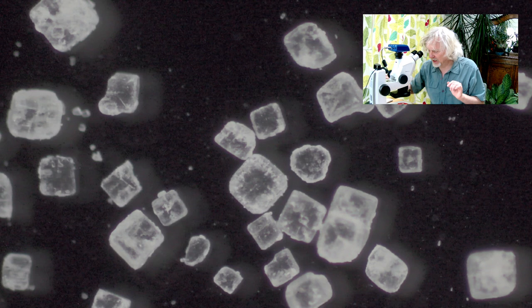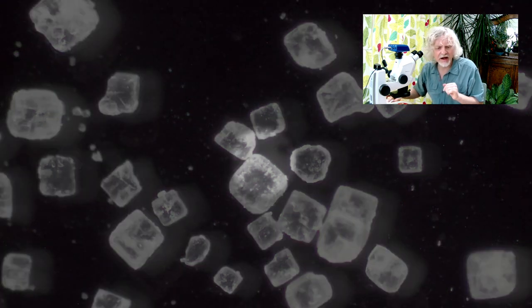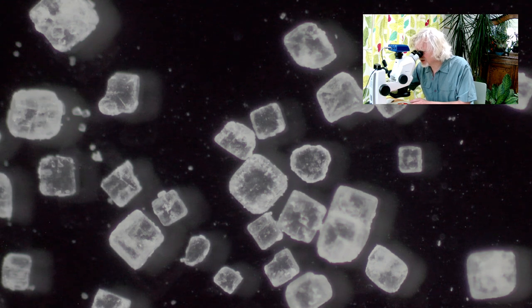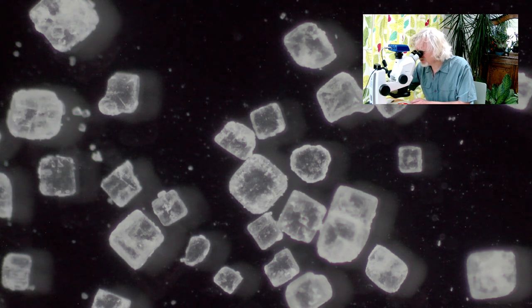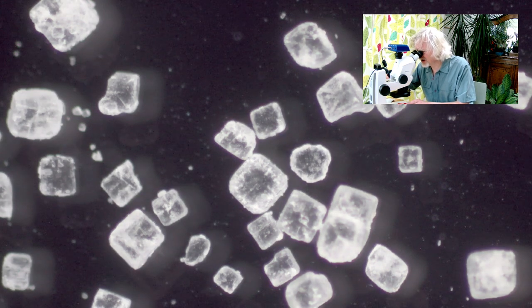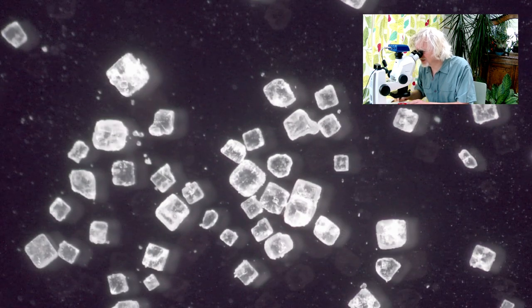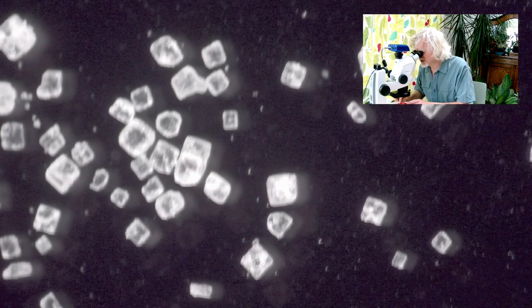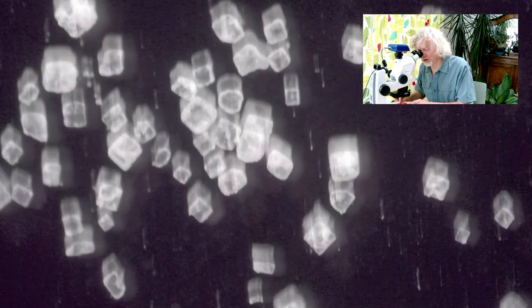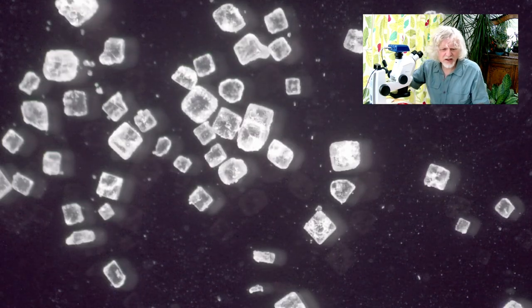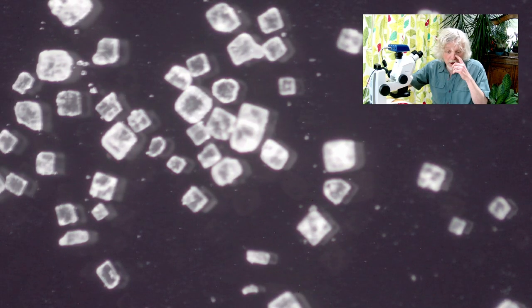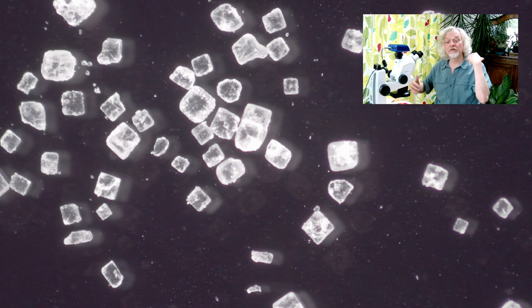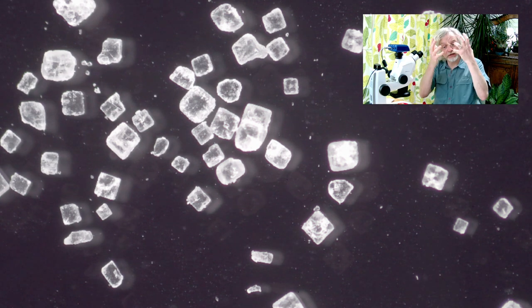Some of them are quite rounded. So this one here has sort of become quite rounded. And some of them are even more rounded than that. Some of them I found are very rounded indeed. But these are actually all pretty nice cubic crystals. So that's what salt looks like under the microscope. You've got these little cubes. And because I'm using cross-polar microscopy, you've got a black background and then the crystals themselves shine up.